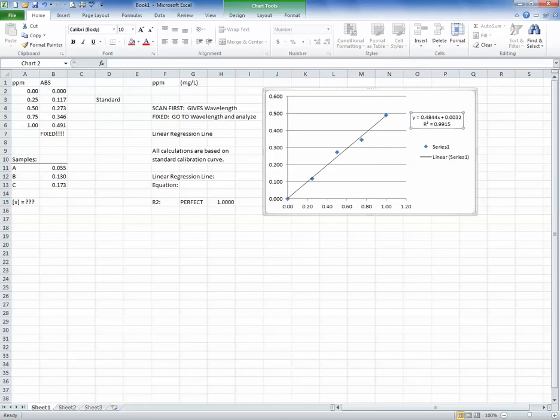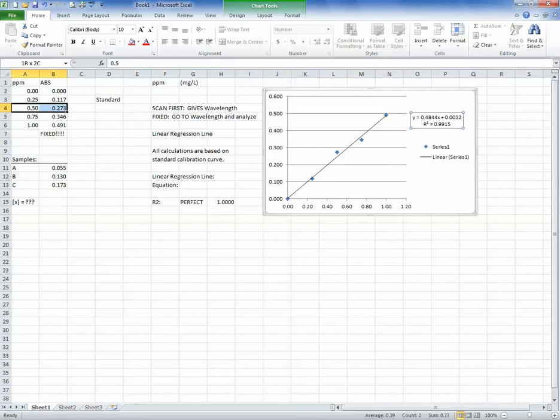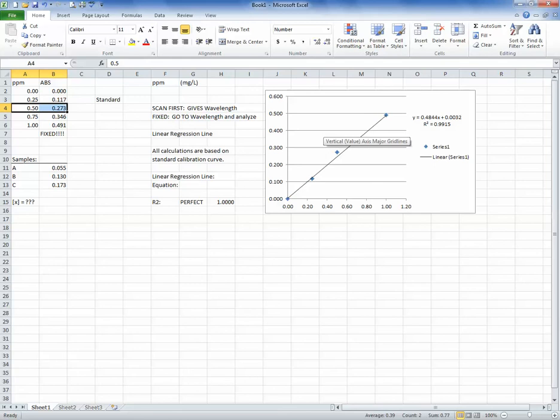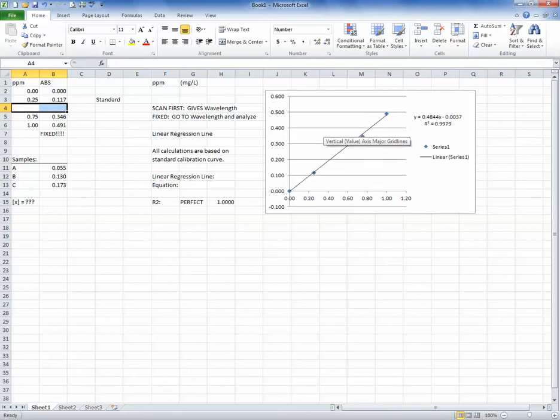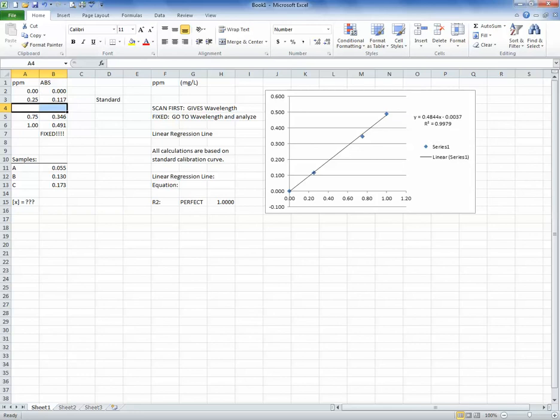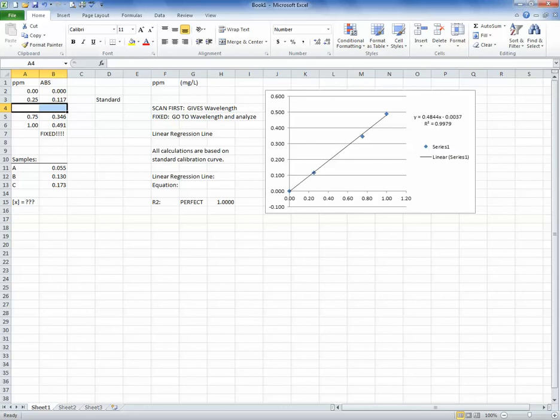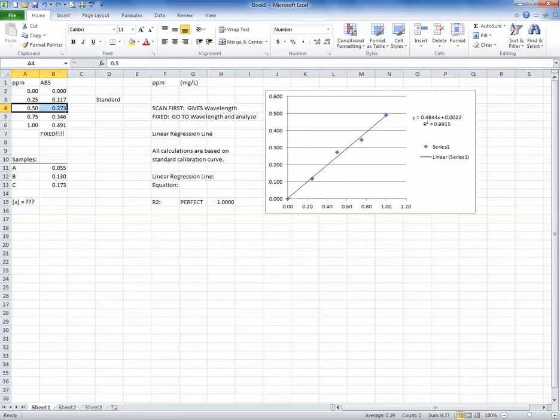Maybe it doesn't really make a big difference, but if it helps you, and it's clearly evident that that point is messed up, then we can delete it out, but only one. So if I look at this cal curve, I see that this point doesn't really kind of fit on the line, and this point is a little below the line. So what I can do is over here to the side, this is the point, if I go over it at 0.5. It tells me 0.5 comma 0.273. So if I come over here and just delete, highlight that row, and delete those two numbers, the calibration curve fixes itself automatically. I don't have to do anything else to it, and look at what happened to my r squared value now. It goes up. It goes now to this point, 0.9979.